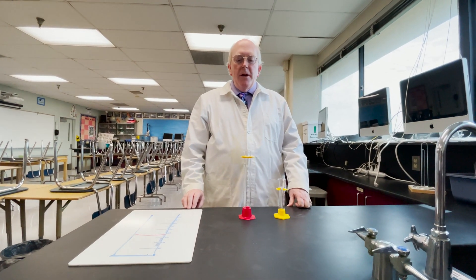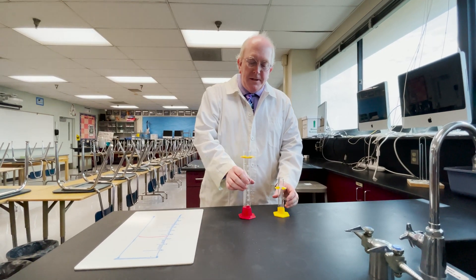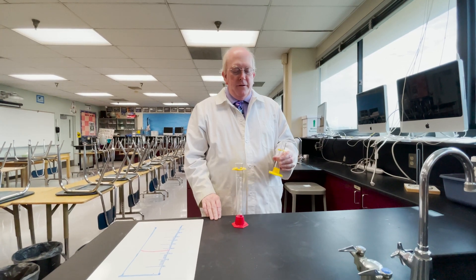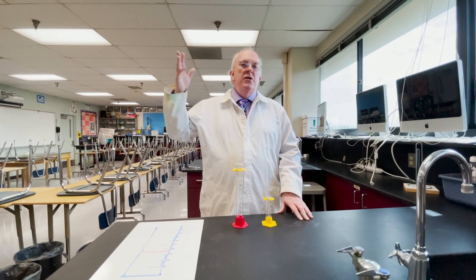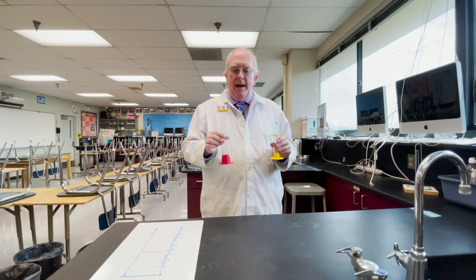Hi everyone, Morgan here. Today we're talking about the proper use of a graduated cylinder. This is a 100 milliliter version and a 25 milliliter version. They come in many other sizes, as small as 5 and 10 milliliters and as big as 1 and 2 liters. These are the two common sizes that we keep in our lab stations.